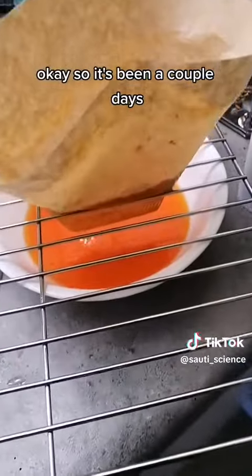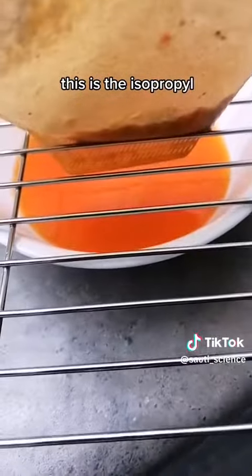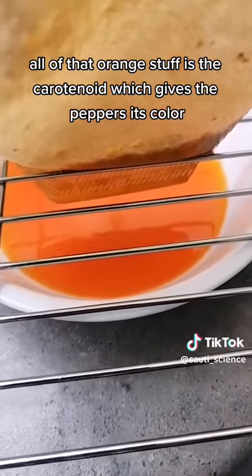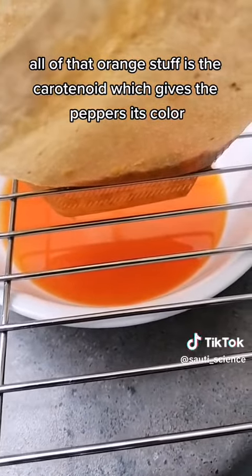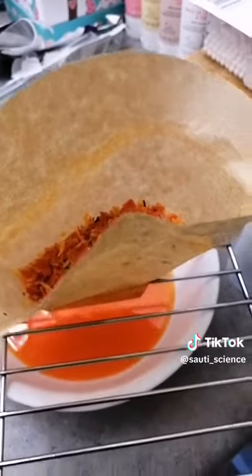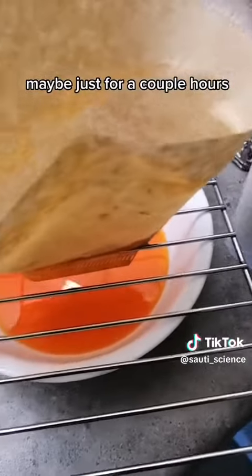So it's been a couple days — this is what we're left with. This is all the pepper chunks, this is the isopropyl, and all of that orange stuff is the carotenoid, which gives the peppers their color. I'm gonna do another rinse with isopropyl and leave this here to gravity filter, maybe overnight, maybe just for a couple hours.